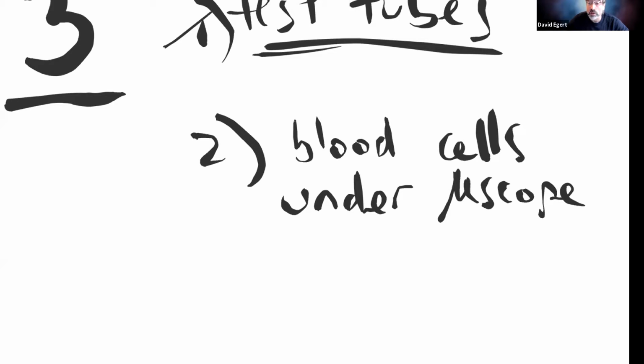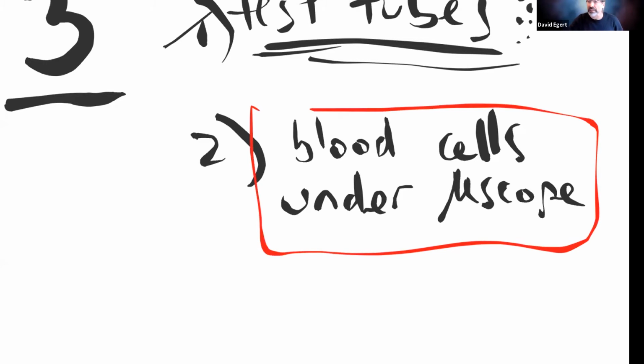Instead, I'll go with you through some photomicrographs so you can get a sense of what cells look like under these different conditions. In your write-up, you'll have to include not just what the test tube looks like, and the supernatant and the pellet, but then a deeper level, what the cells look like inside there as well.